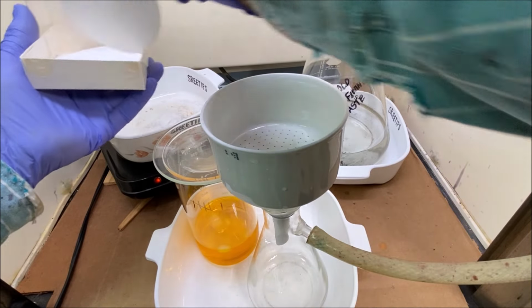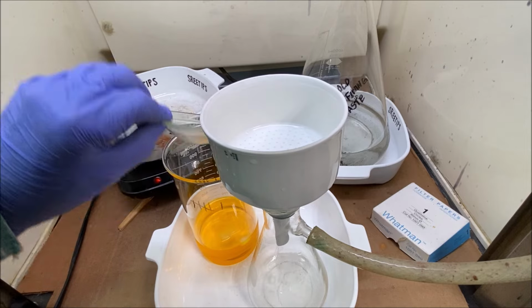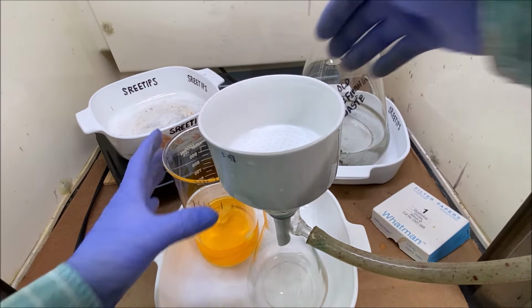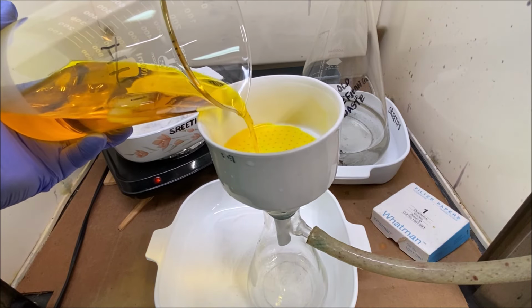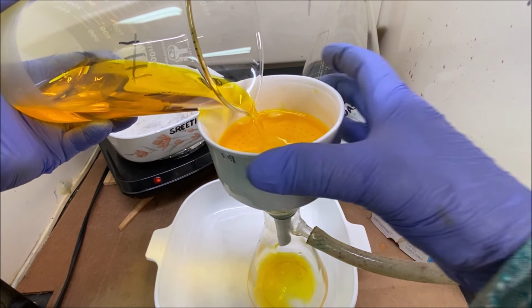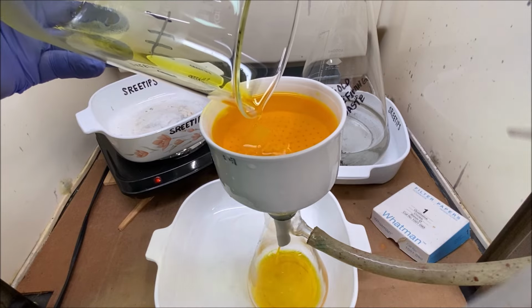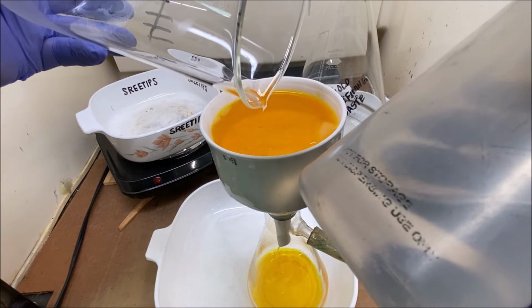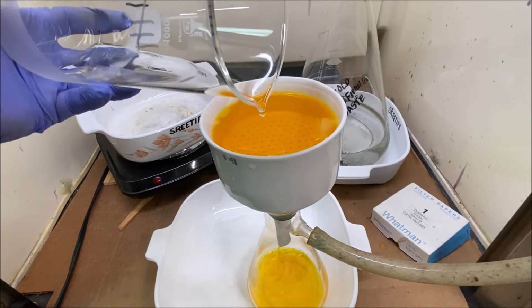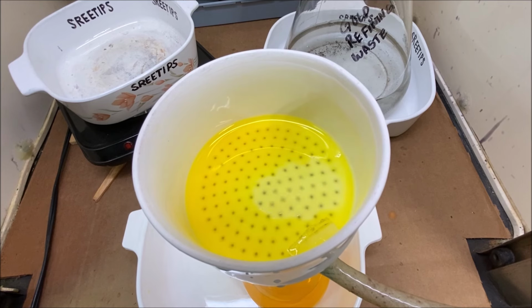Got this cooled off now. Let's go ahead and pour it through our filter, even though it probably doesn't even need it. That solution is crystal clear. Looks like we got a little bit more junk in the filter, which is a good thing.